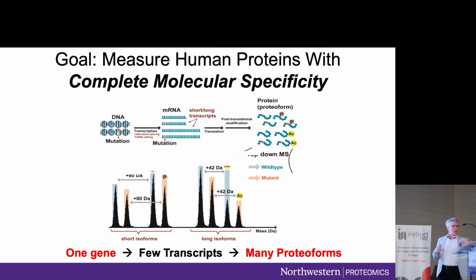Compositional proteomics can really help, both for structural proteomics, but also single-cell proteomics. And this is where our lab's going in one direction, but in another is just to be able to sequence the human proteome. Rolls right off the lips, right? Can we generate a reference set of what is an estimated about 100 million proteoforms from the 20,000 human genes?